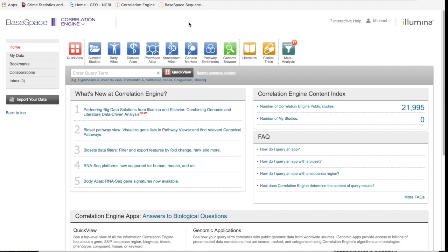This entry is part 2 in a series of instructional videos detailing a meta-analysis on 8 different human gene expression studies looking at papillary renal cell carcinoma. In this installment, I give a demonstration on collecting gene expression data from a single disease using Illumina's BaseSpace Correlation Engine. I also describe the types of biological information we can obtain from this type of meta-analysis, as well as go over exporting the results to other statistical and visual programs for further work.